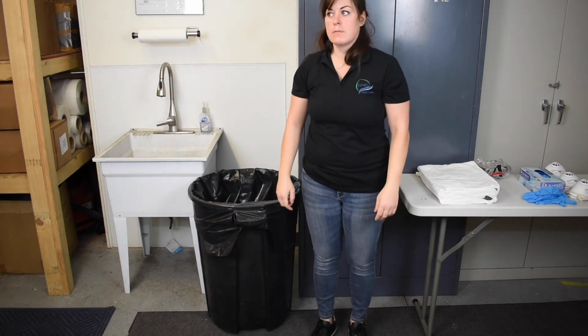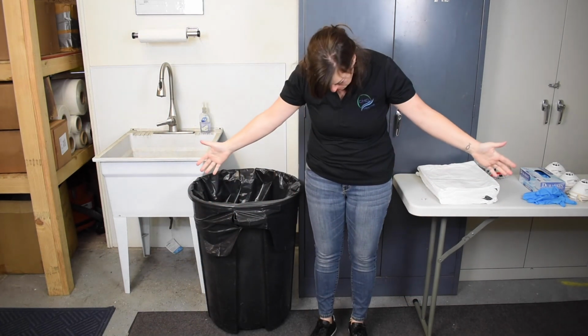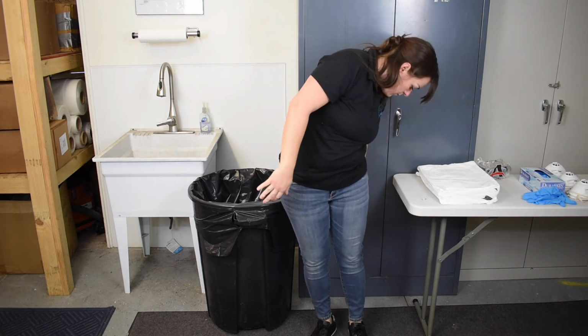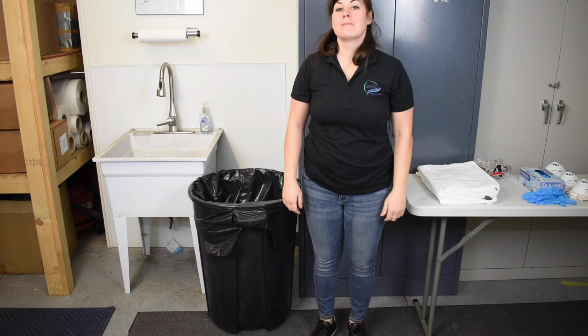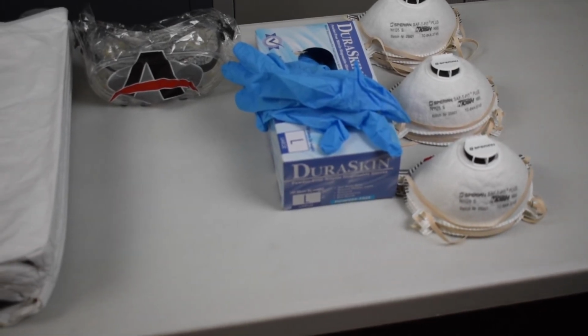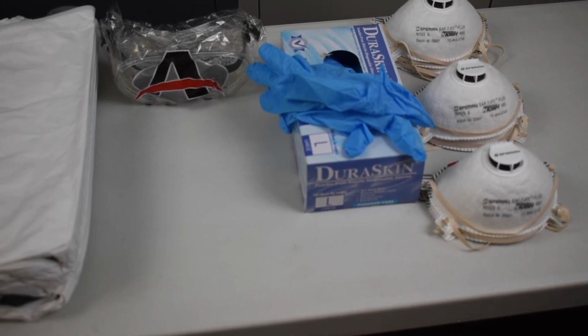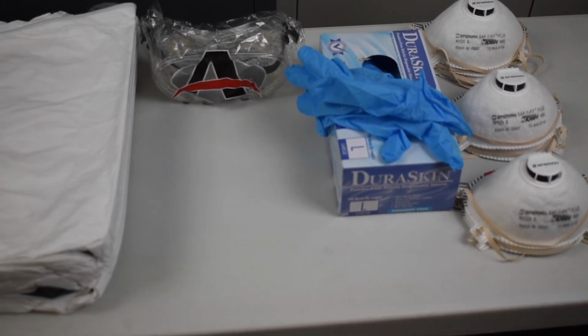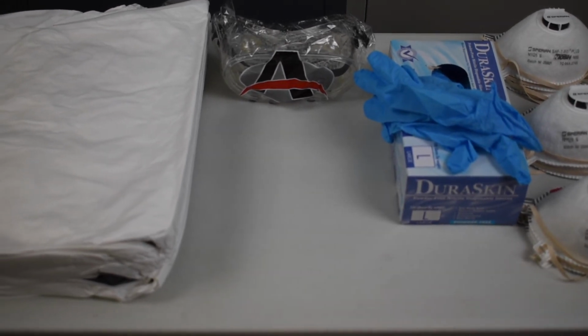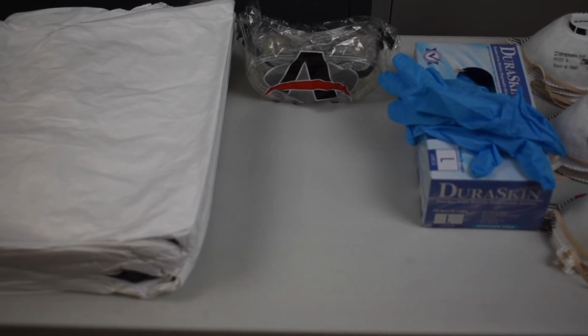Next, perform one final check for visible contamination on your scrubs or clothing. In summary, doffing is a high-risk activity. Therefore, remove PPE slowly and carefully. Be meticulous in each step and perform hand hygiene, as it is critical to avoid exposure to contaminated materials.